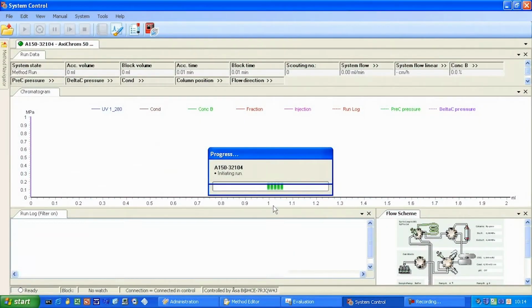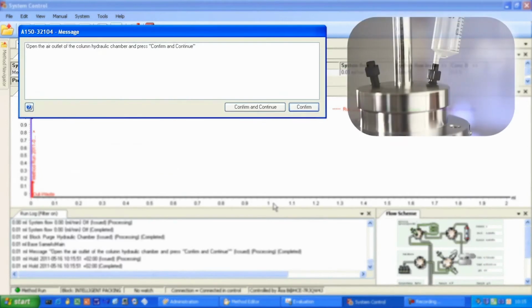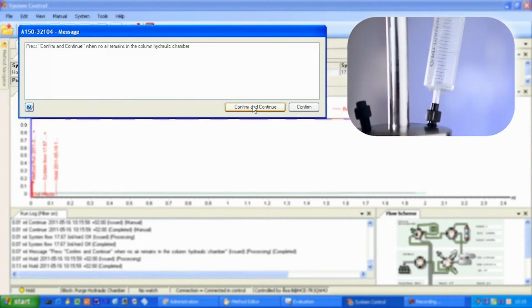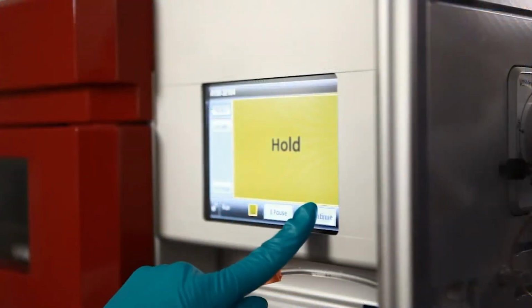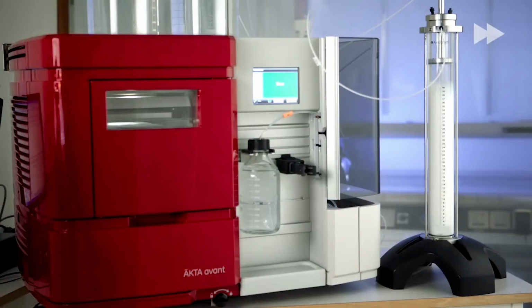The intelligent packing method is started and guides the operator through the packing procedure. Pop-up windows with instructions for every step are shown on the computer screen. Operators more familiar with packing AxiChrom columns may want to use the touchscreen on the AKTA Avant system to run the method. When purging is complete, the adapter starts to move down and the bed consolidates.